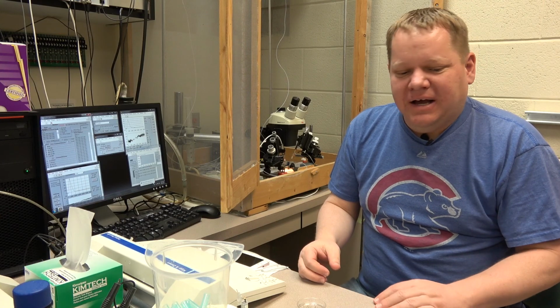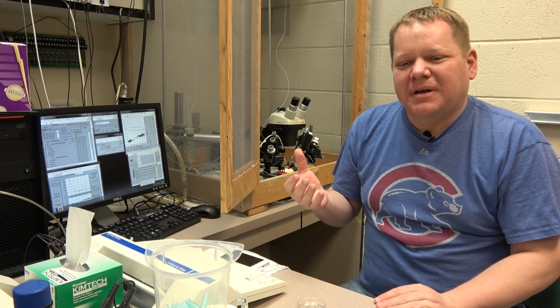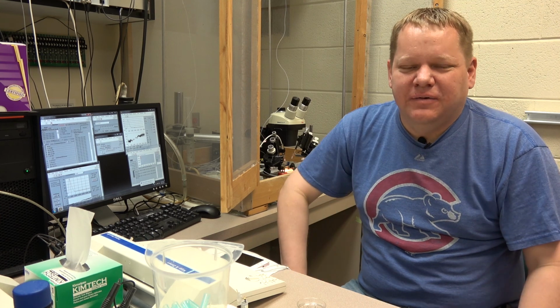And we can then apply our conotoxins to check whether certain conotoxins will block that receptor or if it will not block it. This ingenious neuroscience technique lets undergraduates with less specialist skills get involved in the electrophysiology action, meaning more data can be gathered about the conopeptides in a shorter time frame. That's not the only way to study how conopeptides affect nerve cells.